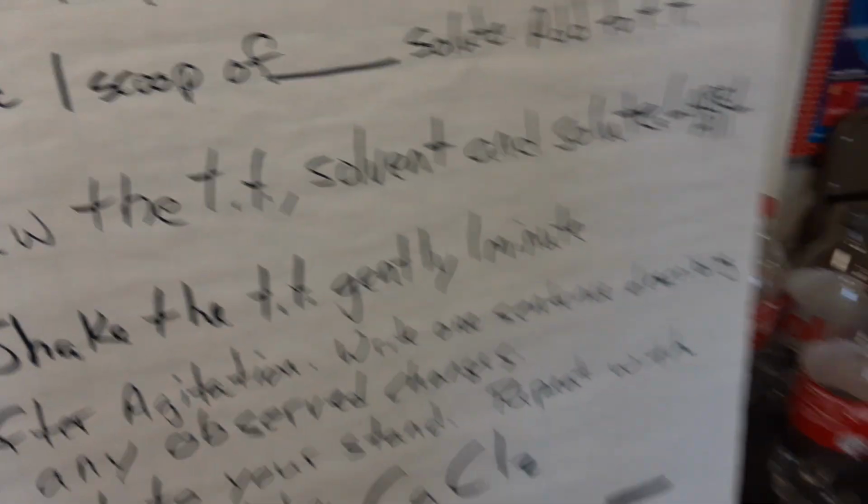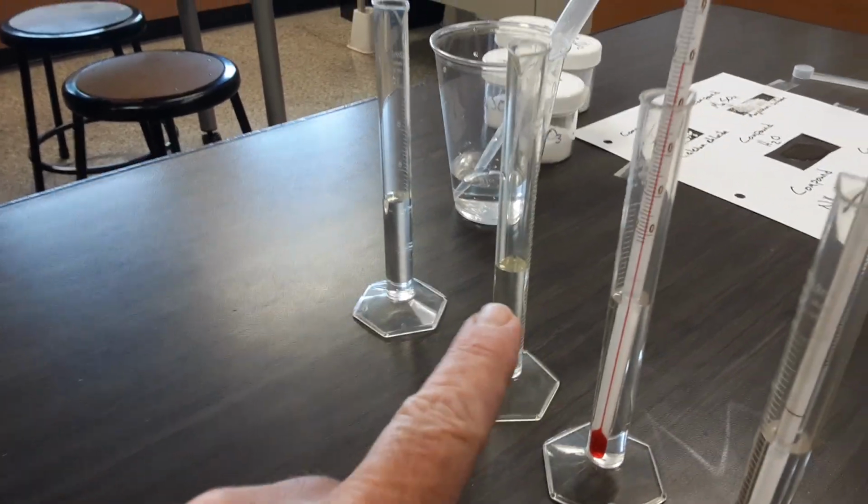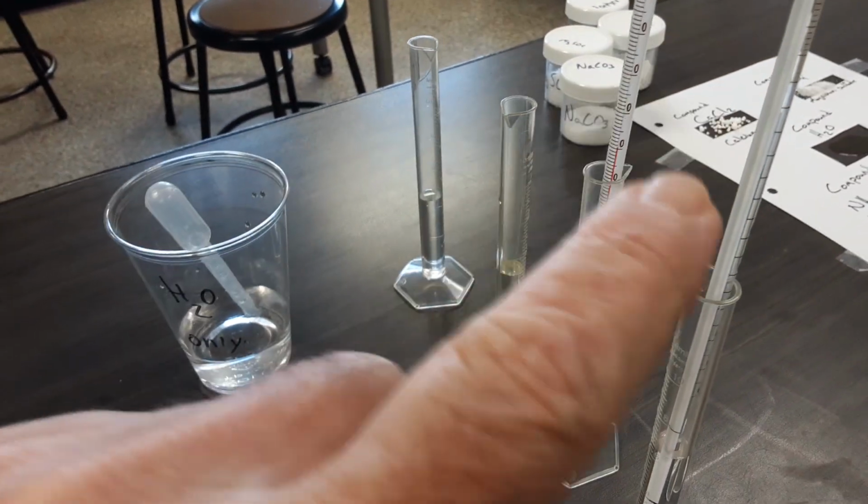We're going to follow some procedural steps and measure some solvents. Actually, we're going to measure one solvent. All of these are water, just pure water. Well, as pure of water as we can get out of the tap. We noticed a couple things about some temperature changes.